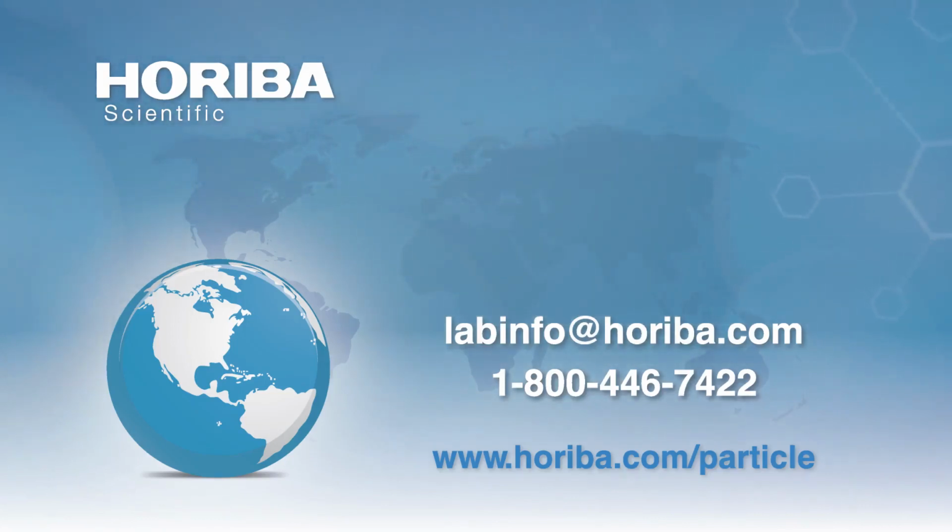The first would be, are we going to use the instrument to look at changes in your system over time and get at questions of particle kinetics? Say, are we having nucleation growth phenomena? How are my particles changing? Because we can extract both concentration and size, we can get at those questions much more readily than, say, light scattering, where you're looking at the scattering over time, which is a combination of concentration and size effects.